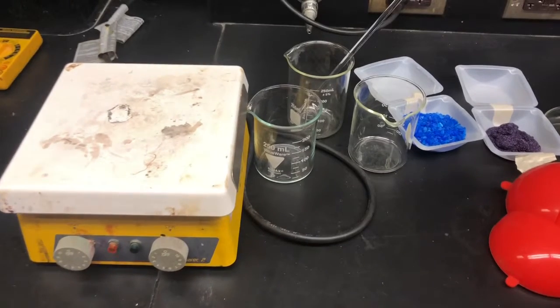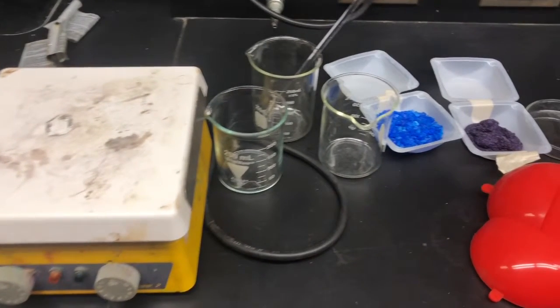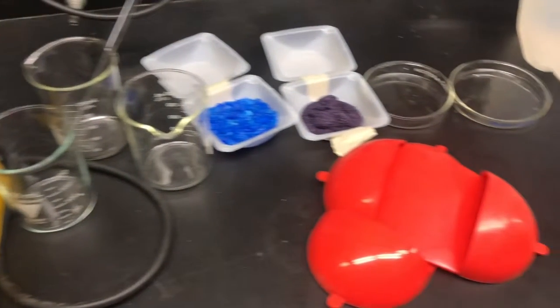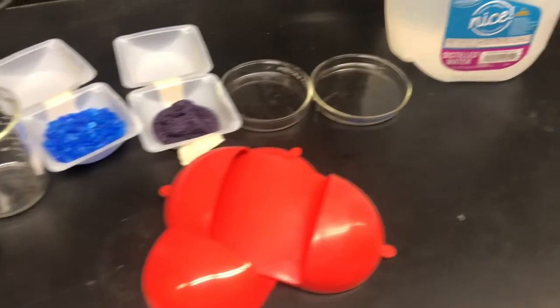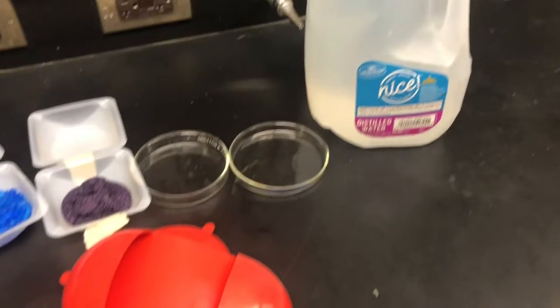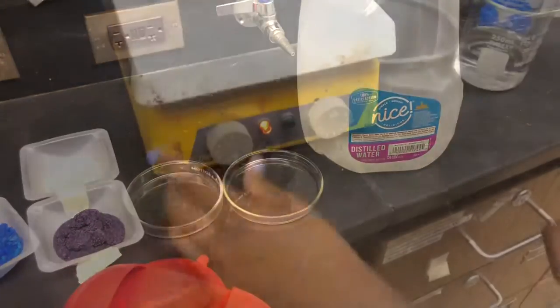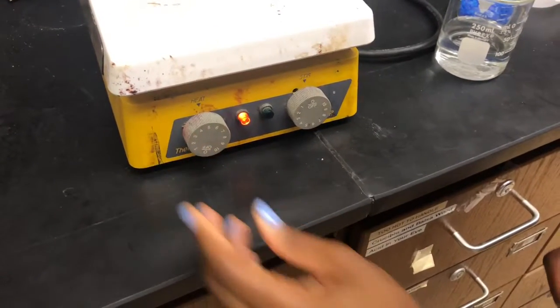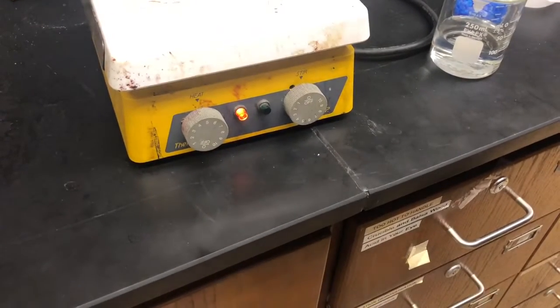First, starting off with the copper 2 sulfate crystal, you'll need a hot plate, at least 2 beakers, a glass stirring rod, 64 grams of copper 2 sulfate, hot hands for safety, a glass lid, and distilled water. Once all the materials are ready, turn on the hot plate to a low or medium setting.